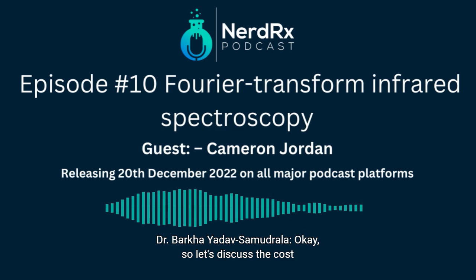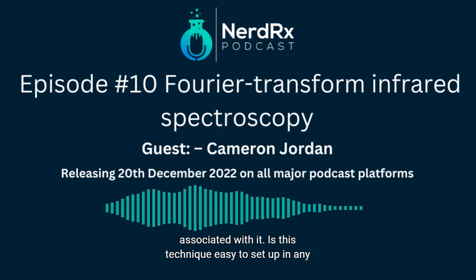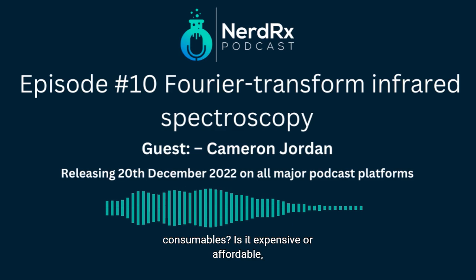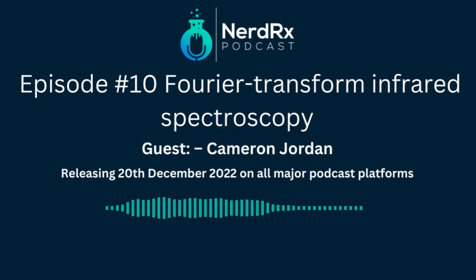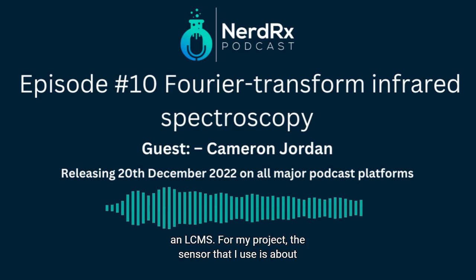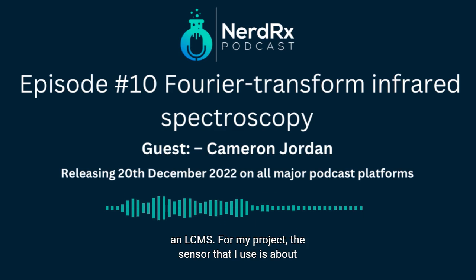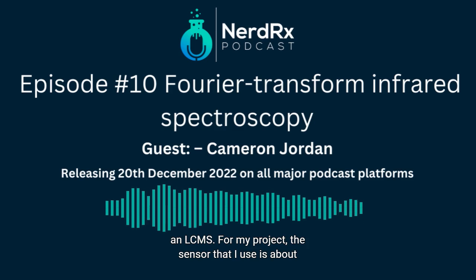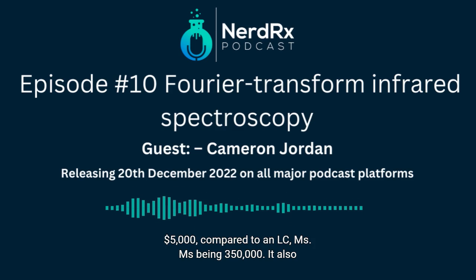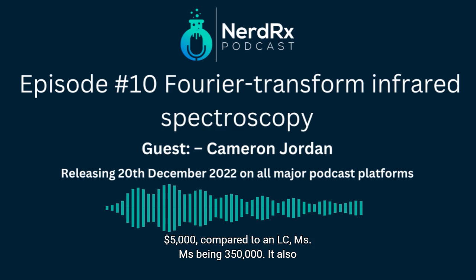Okay, so let's discuss the cost associated with it. Is this technique easy to set up in any lab? And once you have the machine, what about the consumables? Is it expensive or affordable? It's relatively affordable as compared to an LCMS. For my project, the sensor that I use is about $5,000 compared to an LCMS being $350,000.